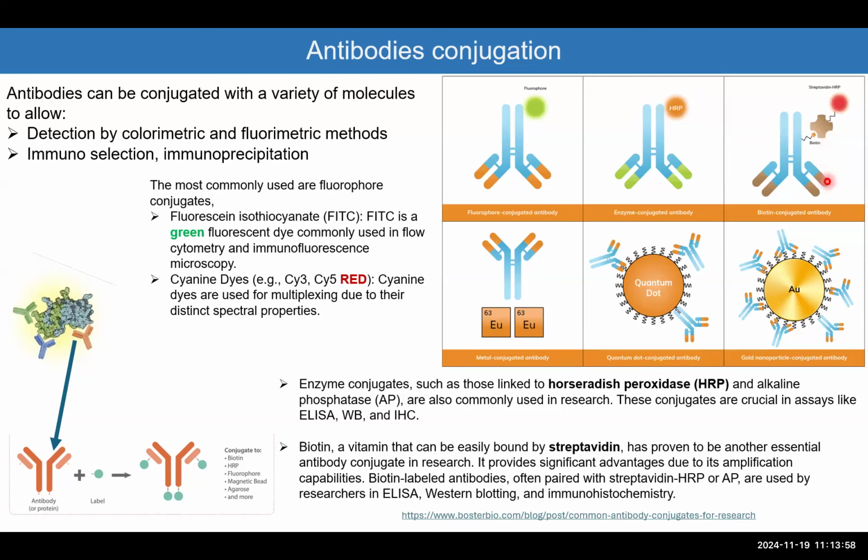And the third one would be the biotin streptavidin. And this is an antibody that we use most of the time if we want to pull down proteins or we immunoprecipitate certain proteins. So say that this antibody is bound to that protein here, and you want to pull it down and see what other proteins probably bind to this, then the biotin streptavidin is the most used. There are others that have different applications. We are not going to go into that one.